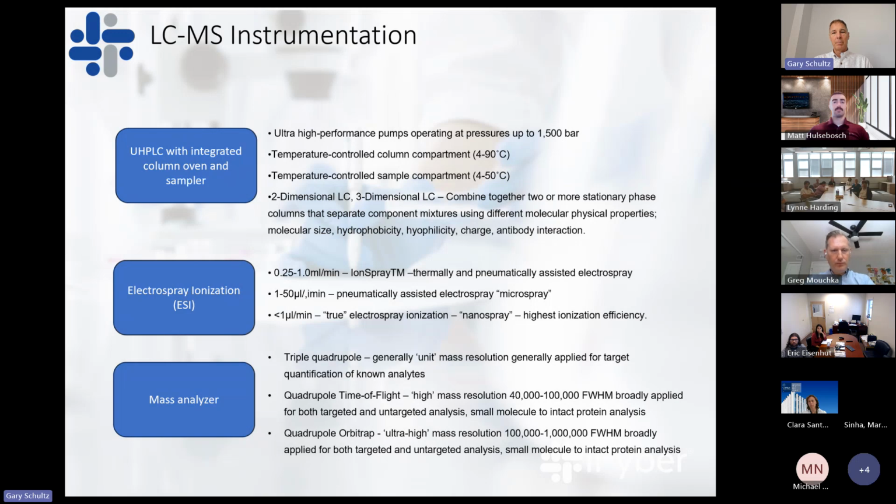But the real benefit in addition to that is the system integration, integrating LC systems directly with electrospray mass spectrometry systems. It's really through that close integration that overall system performance has improved dramatically over the past 10 years, and I want to highlight some of those benefits in our talk today.